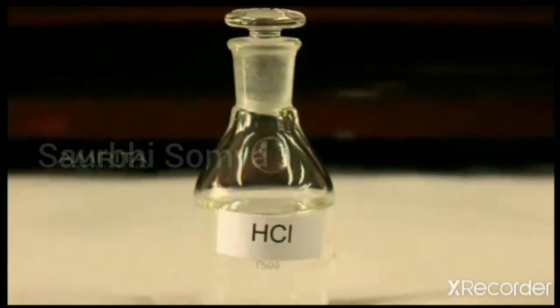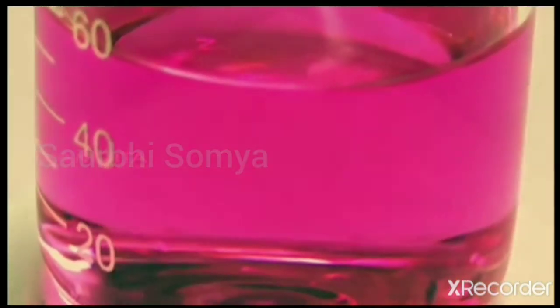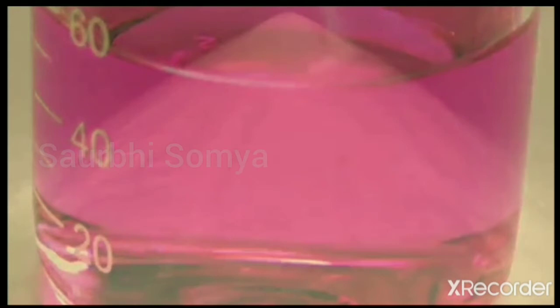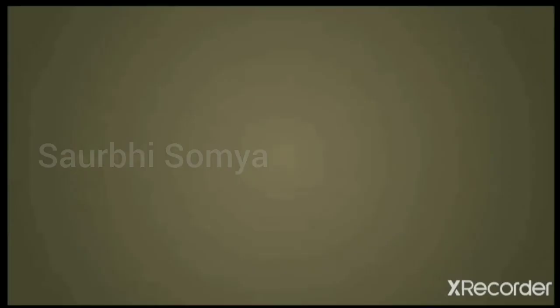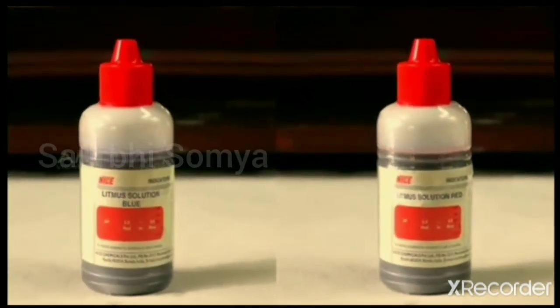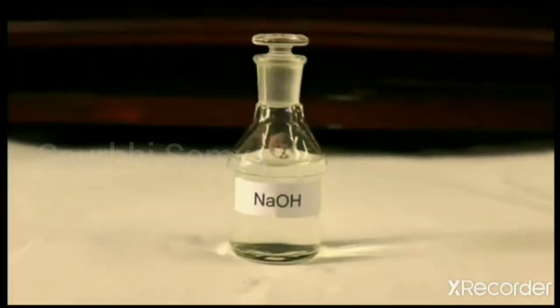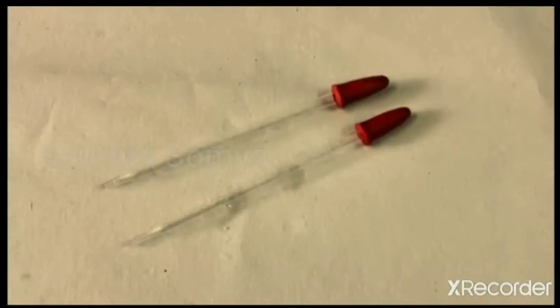Now, in the experiment, our aim is to study the properties of acids and bases, HCl and NaOH, by their action with litmus paper and solid sodium carbonate. Materials required: litmus solution, red and blue, HCl, NaOH, dropper, test tube, sodium carbonate, boiling tube.